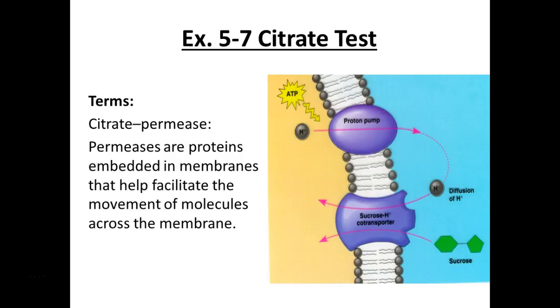Okay, so the next one is a citrate. All right, so this is just an interpretation of the results. In the blue racks with my name on it, you can see what a positive result looks like, what a negative result looks like, and what the tube looked like in the beginning. Most of you have blue tubes, right? But in fact, the uninoculated tube was green. Why does it change colors? It's another pH change, in this case an alkaline pH change.